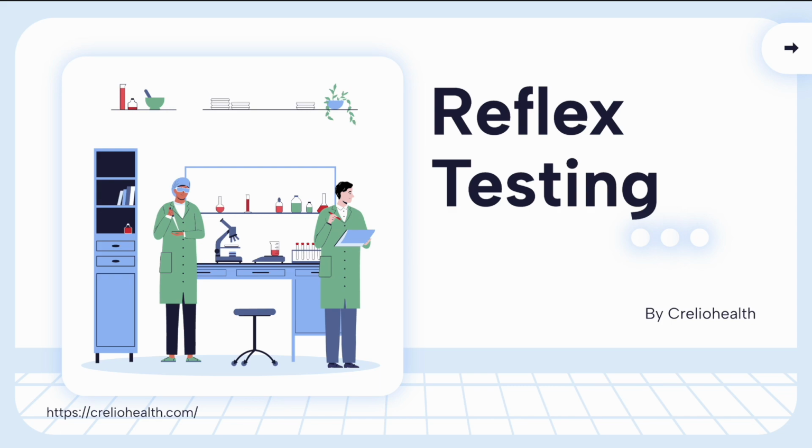So it's like a built-in decision tree where our system identifies that the results of certain parameters in a test are out of normal range or in critical range, and based on these results it will automatically order additional tests without any manual intervention. So let's see how reflex testing is configured in CrelioHealth.